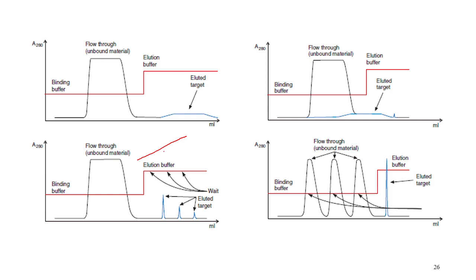So that also comments on the different regions of your proteins, or how stable your protein is, or what are the domains associated with it. Okay, so it also starts eluting but at different concentrations. So you might get three peaks and you have to collect all and run it on a gel and check which is your protein of interest.